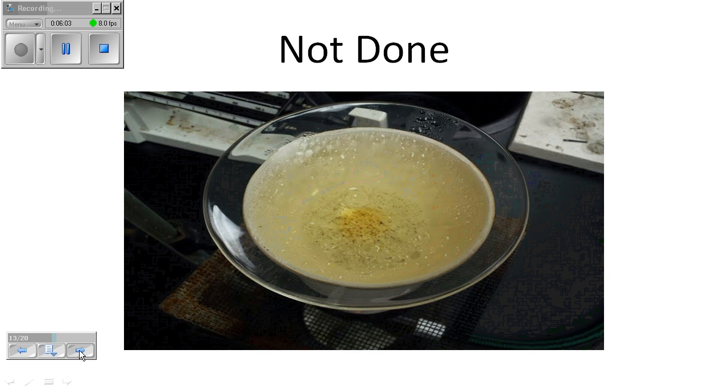Okay, now as you're heating it, you may see it look kind of like this. Inside it looks a little bit like a raw egg. It's white around the outside with probably a yellow space in the middle. This is not done. We want it to be dry, and if you look on the watch glass, you can see that the watch glass still has a lot of water on it. So this is not done. So please don't ask, is this done? Because it's obvious that there is still some water going on there. This is going to take a while, and patience is really the only thing we've got going for us here.